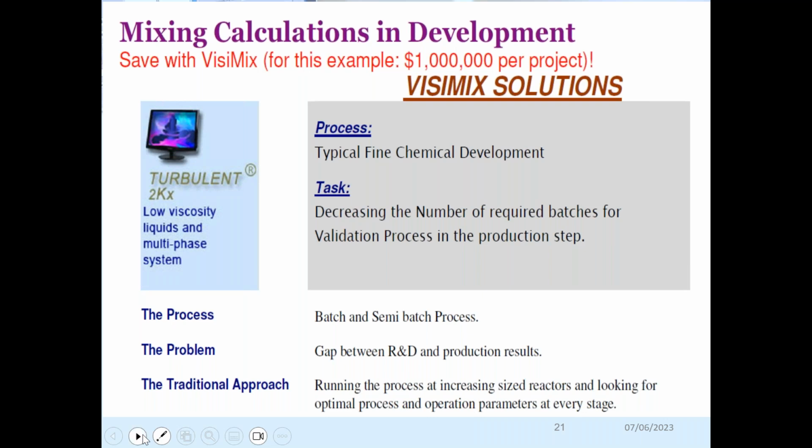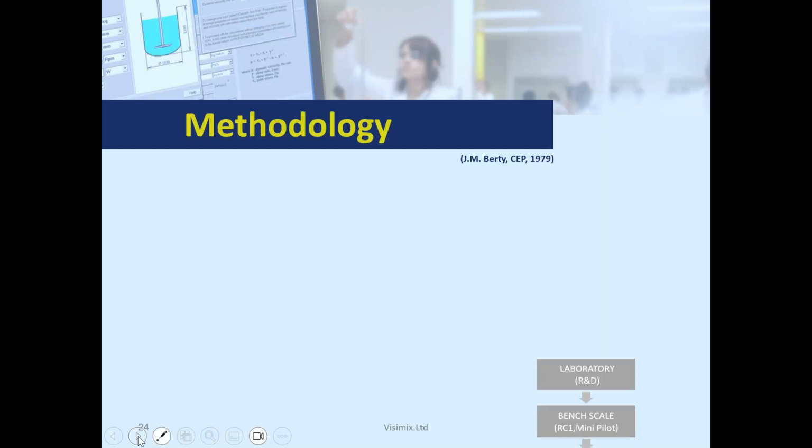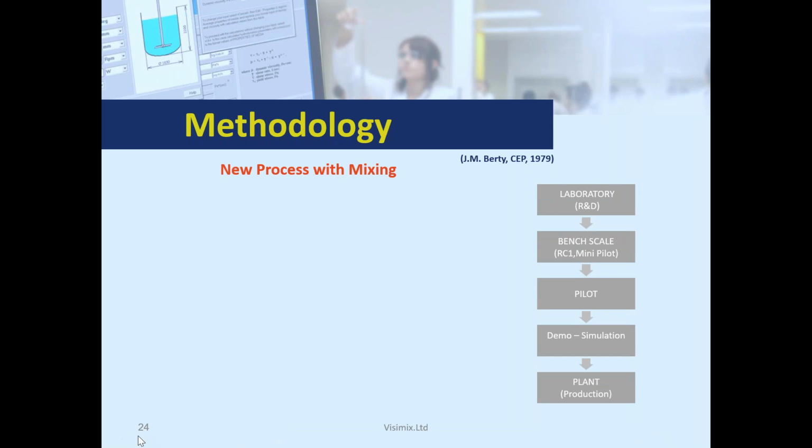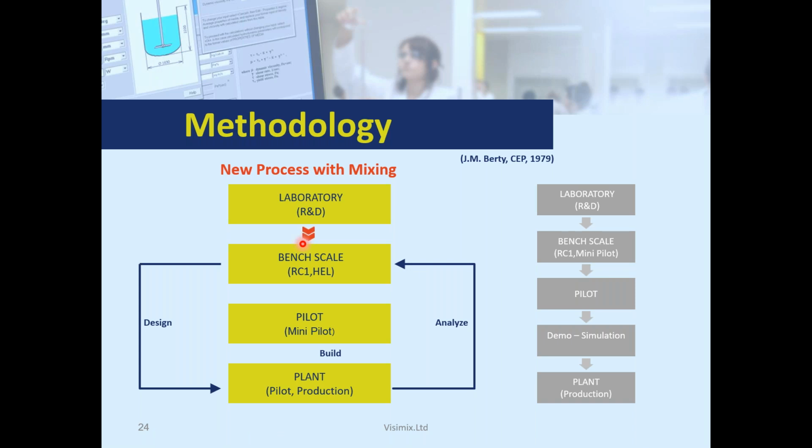So when I was pilot manager, we did some job about it, and the main way to work, or the best good way to work, is to understand the process in the lab, and calculate with the software, or know what is the flow you are generating, and set up the same kind of flow in your tank in the way that you are bringing your process with the conditions you will provide in the next step.